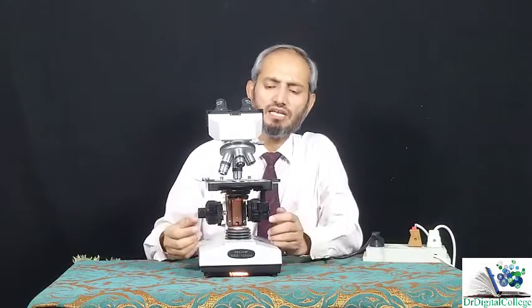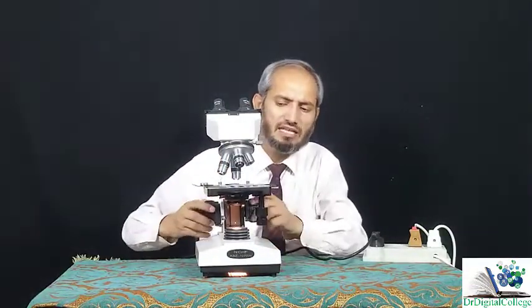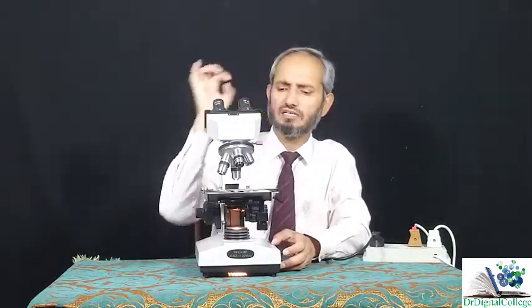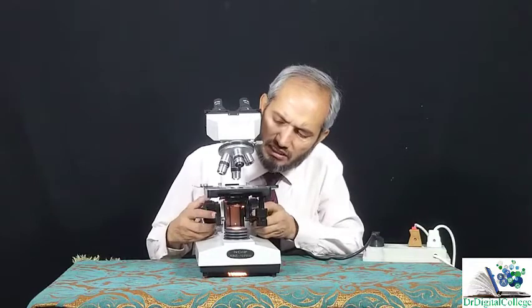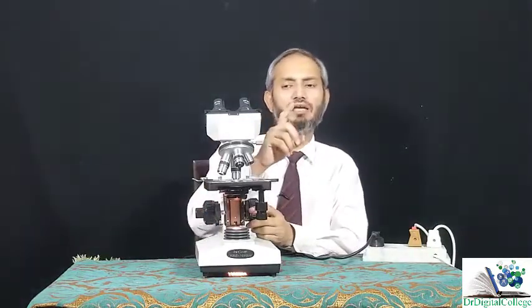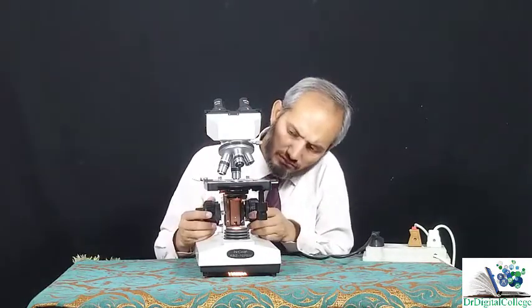So the simplest and shortest method for magnifying different objects is this: put your slide over here, lower your stage like this to the lowest position, and adjust the position of your object so that, with the light on, you can see a very small object in the center. Now, while directly observing your slide, keep moving the stage upward until it is just about to touch your objective lens. Keep in mind, I'm doing this while using the highest magnification, where the objective lens will be closest to your object. So I have moved here.